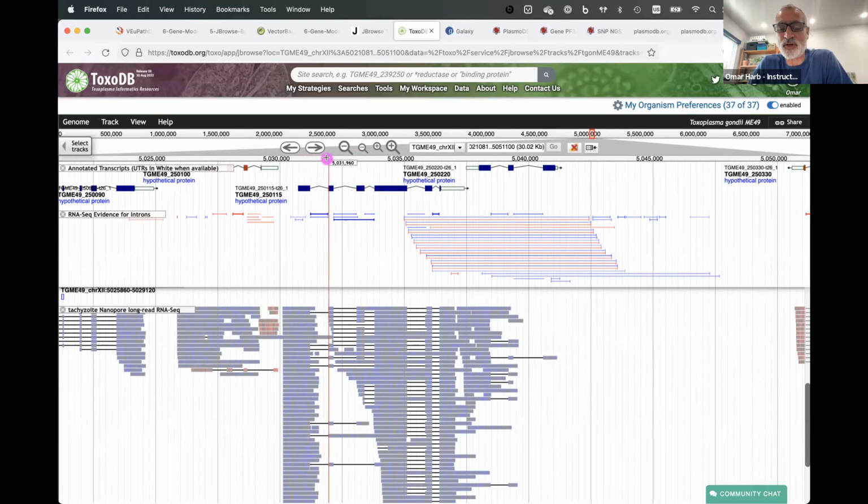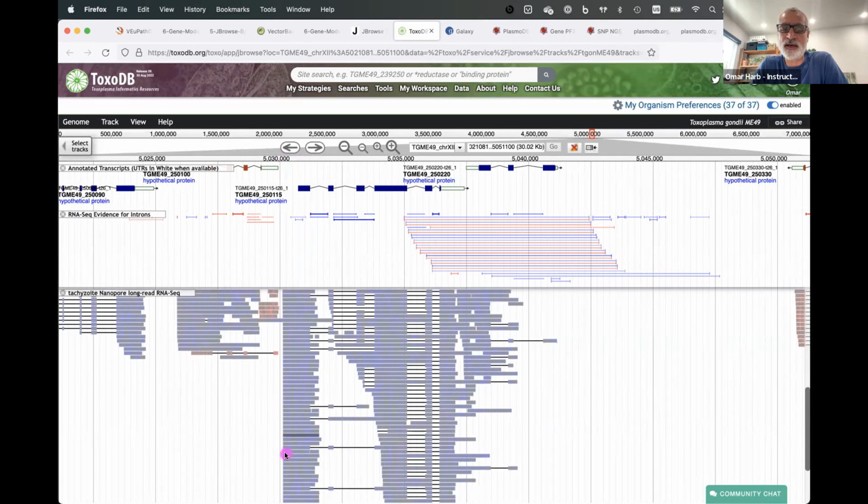Right. So it could mean that. It could also mean that your long read data is also sequencing some intermediate RNA species that are not fully processed. And that could be a possibility. There may be some other nuances of long read data that could happen here. Maybe Catherine would care to comment. But I think one thing you can conclude from this data is that the majority of the transcripts all start at a particular location, right? So we can be confident about that at least.